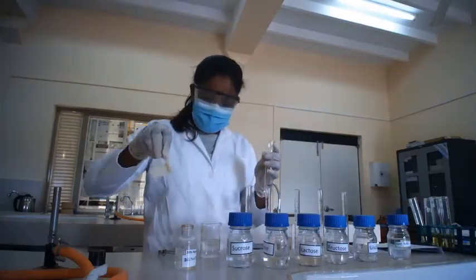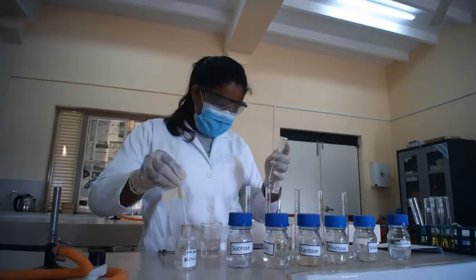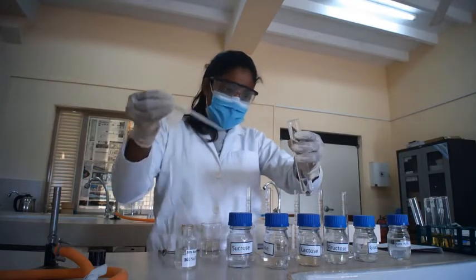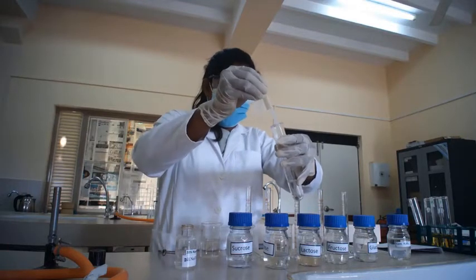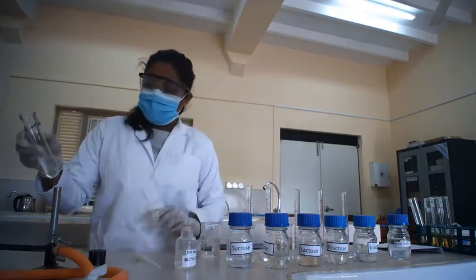Add the same amount of sodium hydroxide into the sucrose solution, and boil in the Bunsen burner and observe the color change.